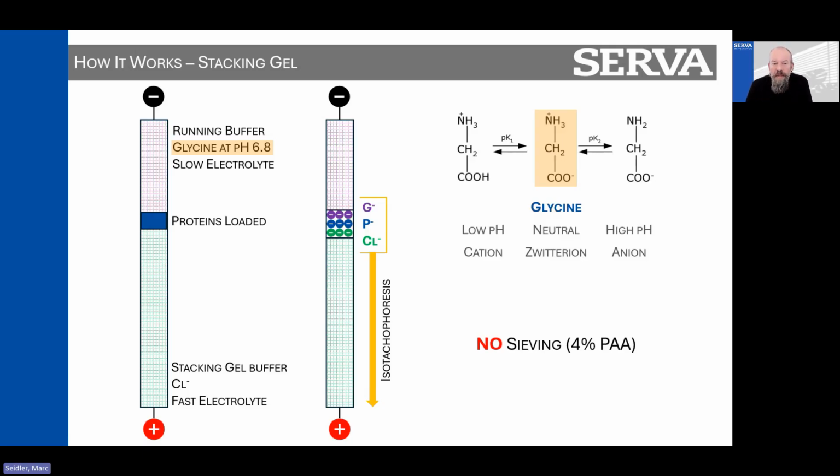Or you have a completely other pH, for example, 7.5 or 6 or so, then the complete chemistry is destroyed as well. It must have these 6.8 in pH to work. So please check your pH meter and calibrate it always to be sure that this is 6.8.